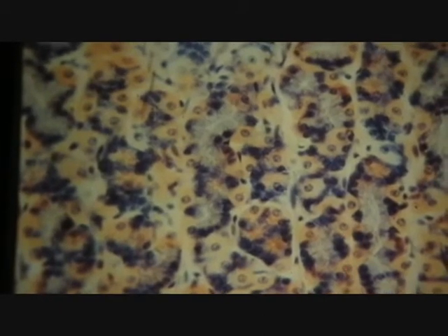And then as you go down, start to see the bluer ones. So if we go a little deeper, magnify a little bit more, we can see the clustering of those blue cells. Once again, it's the cytoplasm that you're looking at for color. So you would know those as chief cells. Quite obvious. But you can also see parietals and even these.